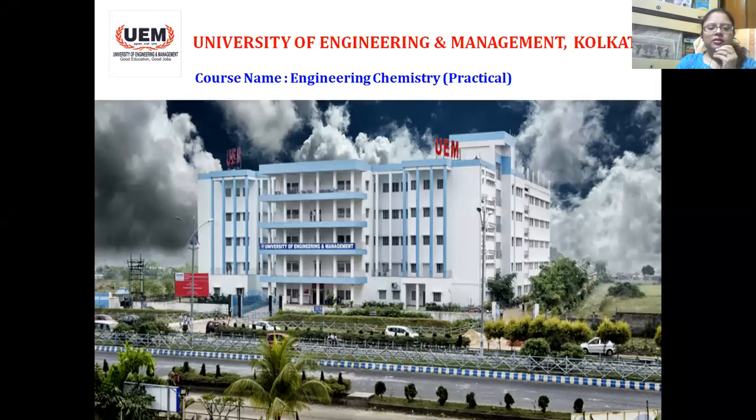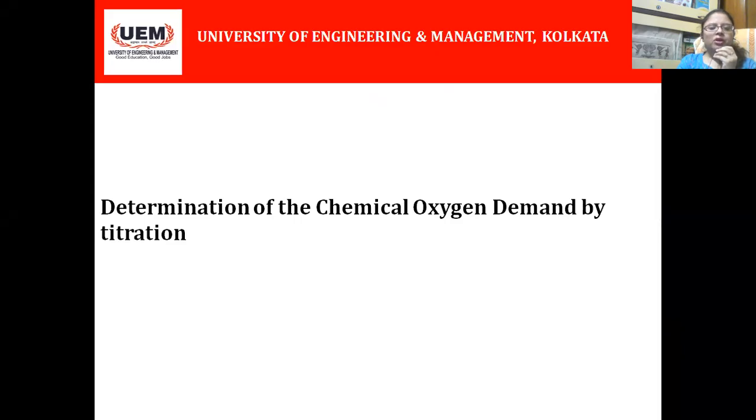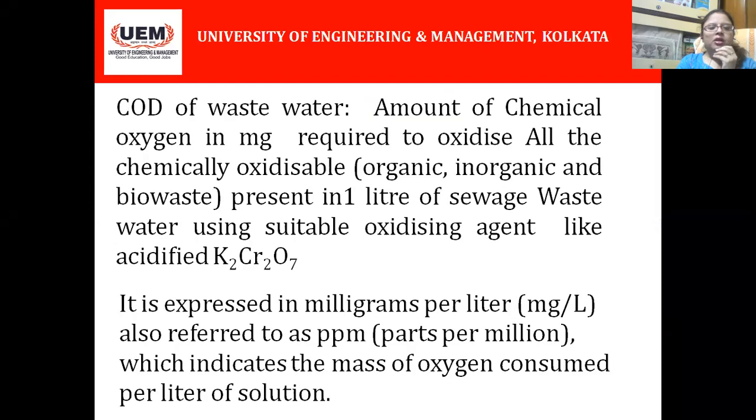Today I'll discuss some practical that is incorporated in your syllabus of engineering chemistry. Today my topic of discussion is determination of chemical oxygen demand, that is called COD, by titration. Now, first of all, you have to know what is COD.